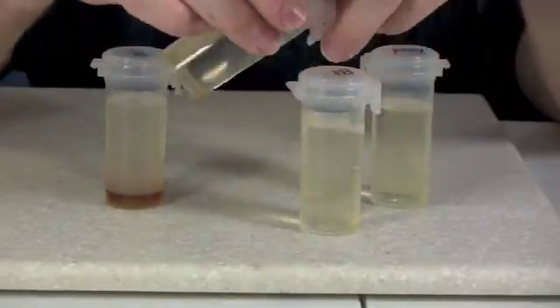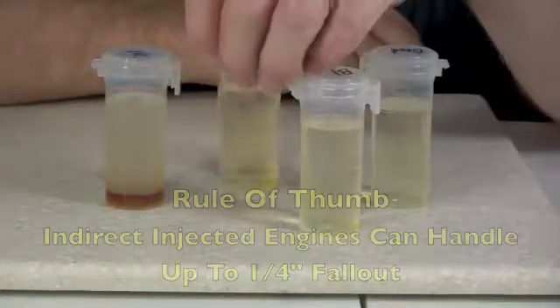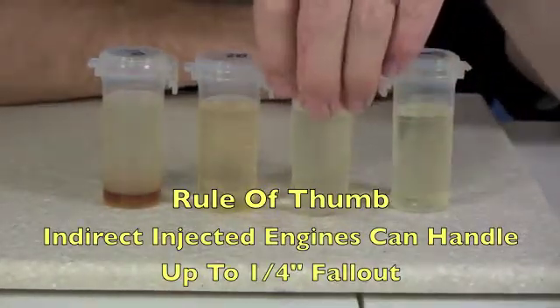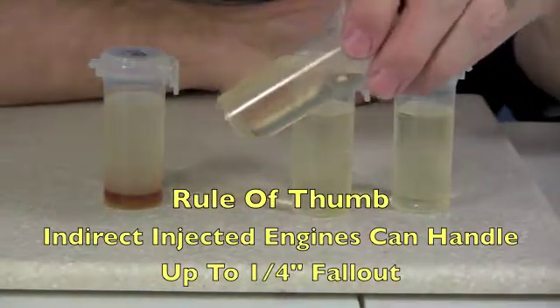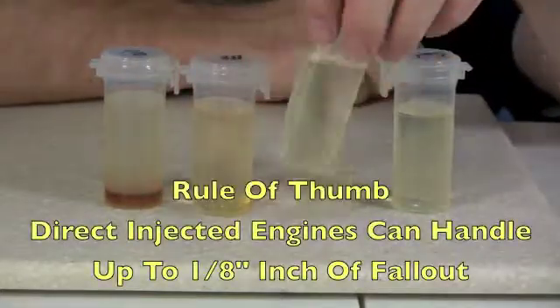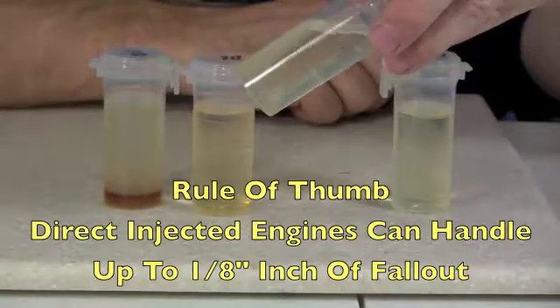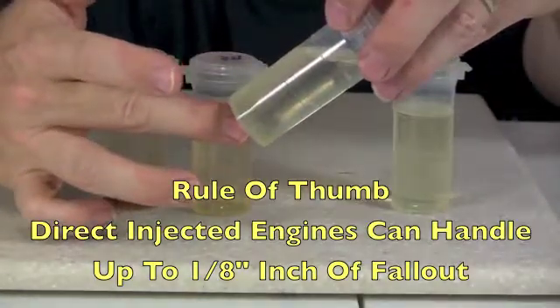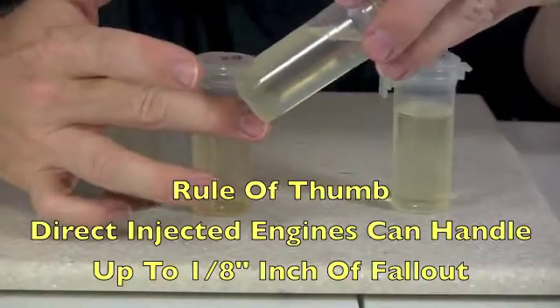My rule of thumb is in vehicles with indirect injected engines, up to about a quarter of an inch you can get away with burning this fuel. If you have a direct injected engine such as a Duramax or some of the newer ones, you could probably get away with about zero to an eighth of an inch, but no more than that. This has got maybe an eighth of an inch of fallout in it.